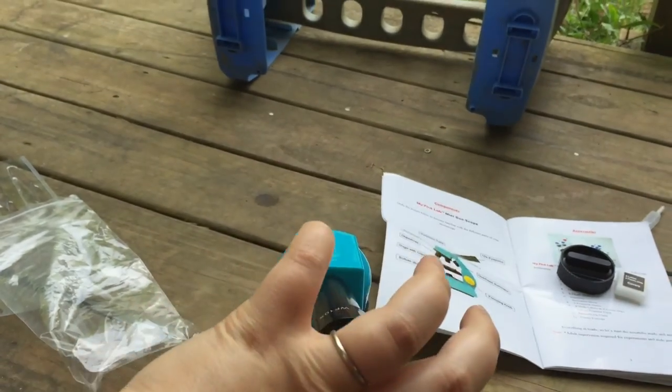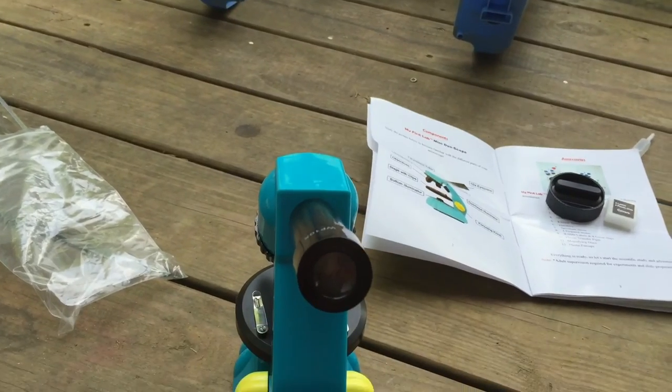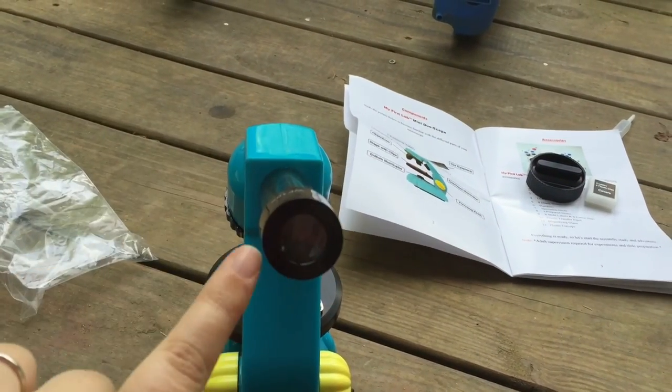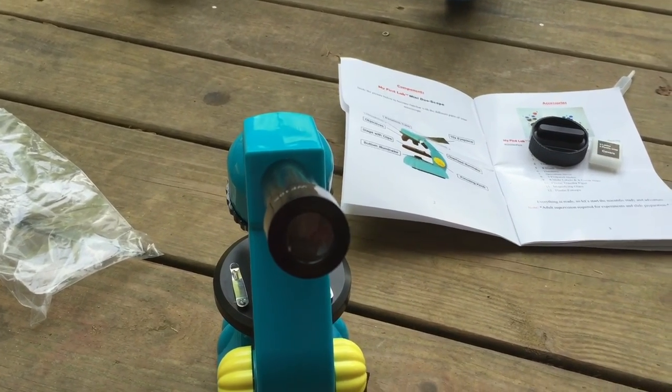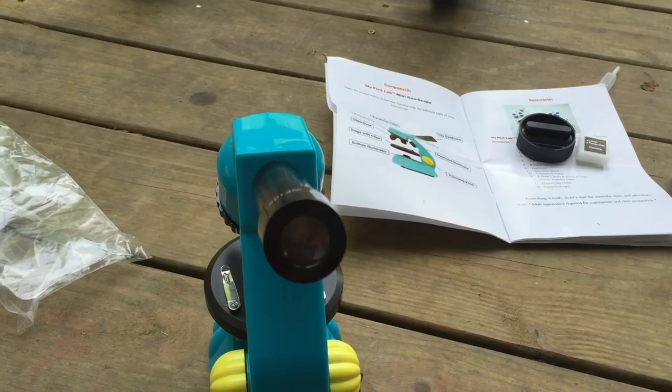Here is a leaf at 40-times magnification — it's a dried leaf — and the previous one was actually 100 times. It's really hard to get a good view using my camera, but you can also purchase an attachment that goes on right here so you can take digital pictures, and it explains how to use your phone or other digital device to get pictures through the microscope. That is my review — let me know if you have any questions in the comments below. Thanks, bye!